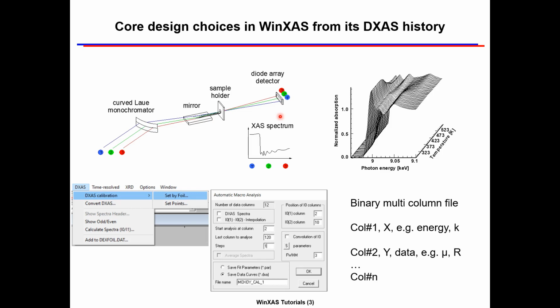For this purpose, a number of numerical algorithms and XAS analysis routines were added to the core of reading and calculating EXAFS spectra from raw data files. Later, during my postdoc, I did some time-resolved X-ray diffraction, and again we needed certain procedures to analyze series of diffraction patterns, so I added those to WinXAS. I hope this explains some of the features you still find in the software to this date.